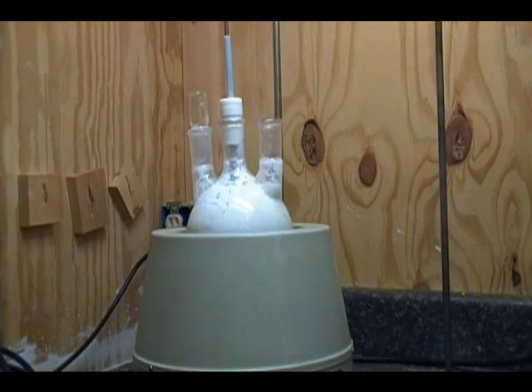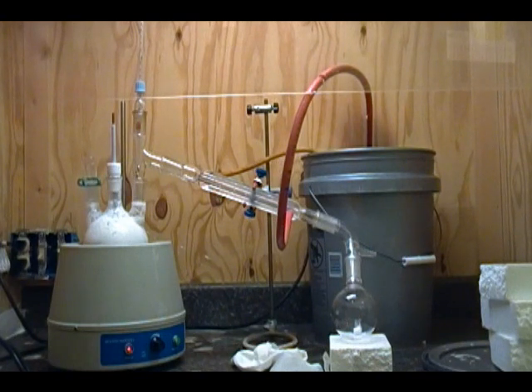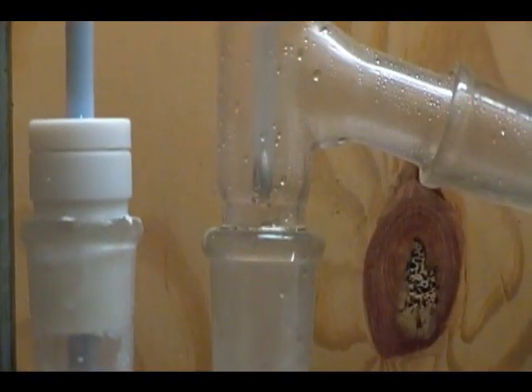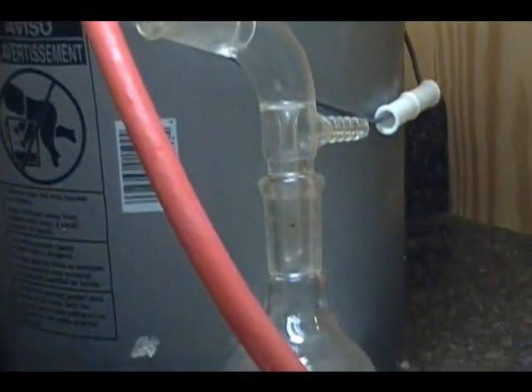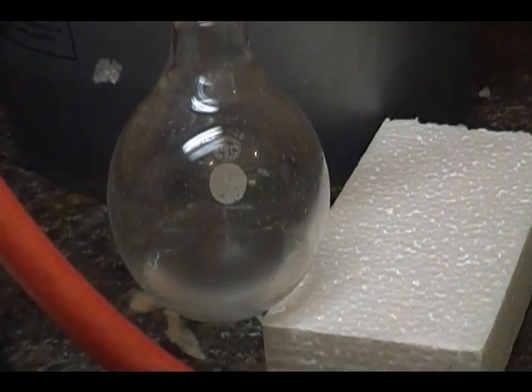Place your flask in your heating mantle and set up for a simple distillation. You'll need to turn on the heat and you should start getting acetone at around 45 degrees, followed by chloroform, and then last water if you even go that far. The distillation is started at this point and as you can see we're getting product.